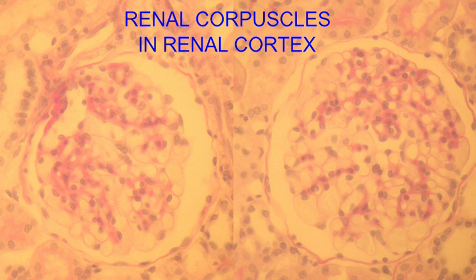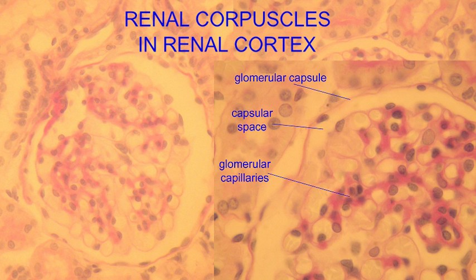All renal corpuscles exist in the renal cortex, and they can be recognized because their glomerular capillaries are surrounded by a glomerular capsule made of simple squamous epithelia, and a capsular space separates these.